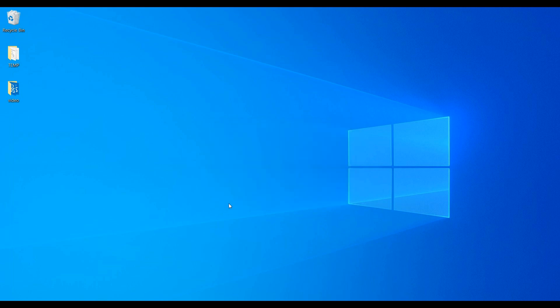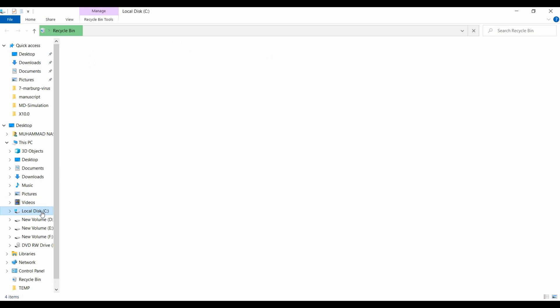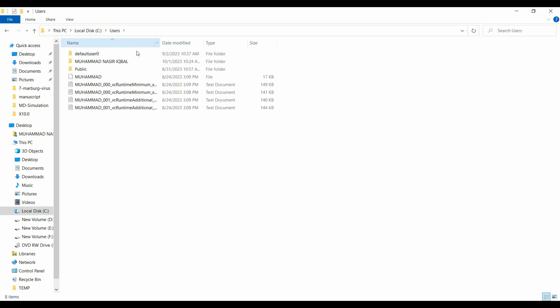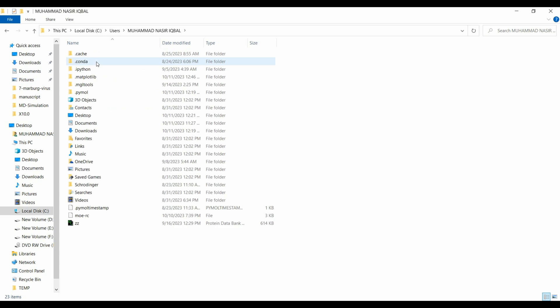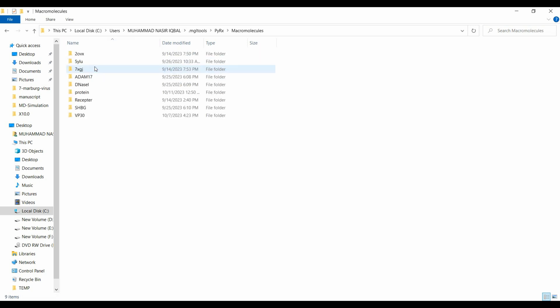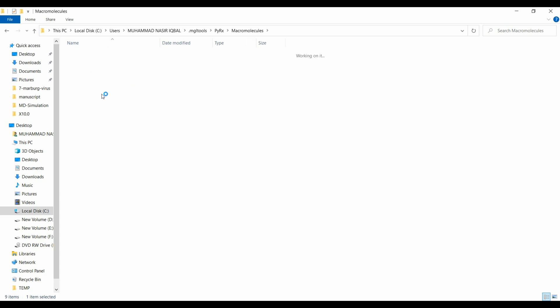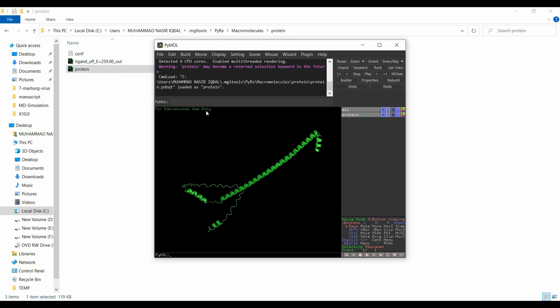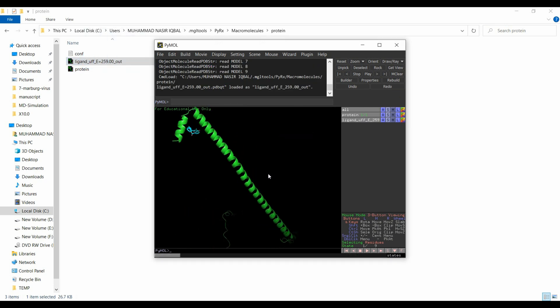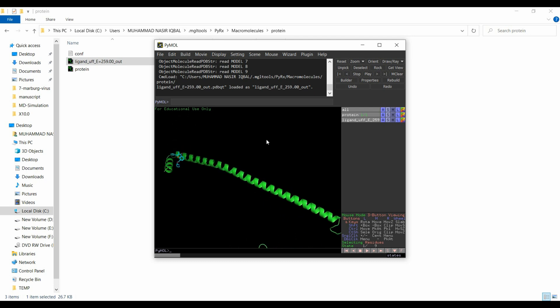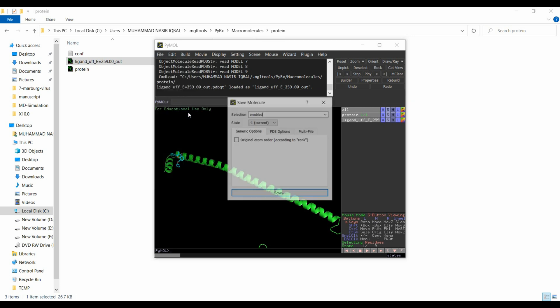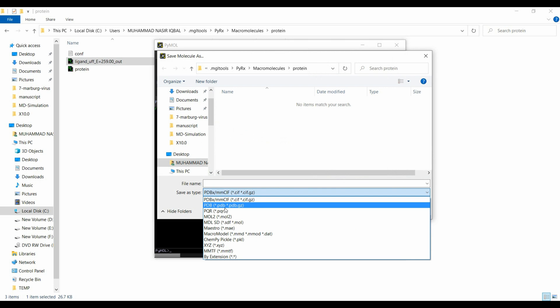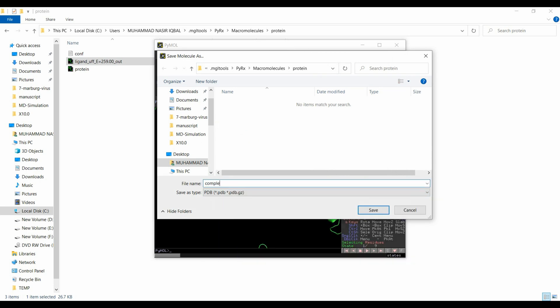Close PyRx, then navigate to C drive, Users, your username, MGL Tools, PyRx, Macro Molecule, and open the folder you made for your docking. Open the protein file in PyMOL, then drag the ligand into it — the ligand will be attached and you will have your complex. Go to File, Export Molecule, click Save, select PDB format, and this is your complex ready for molecular dynamics simulation.